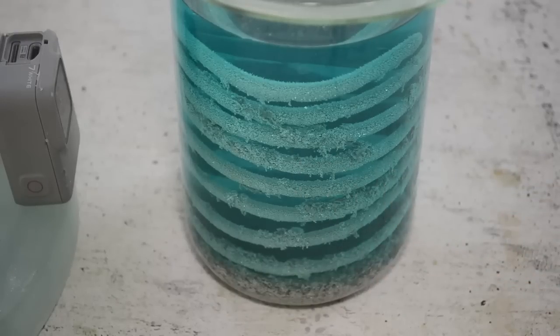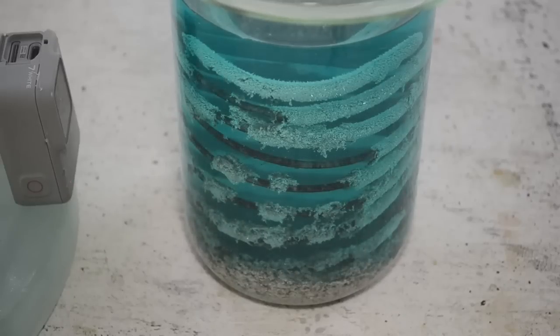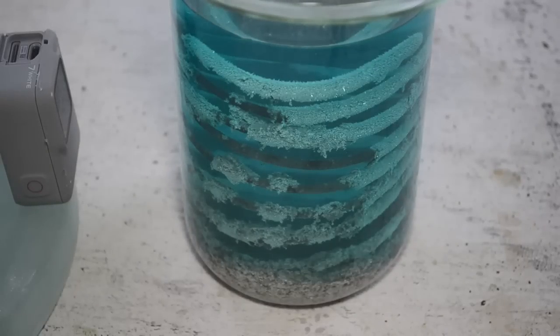Very cool. Very cool. And right now, the wire in there is about 3 times its original diameter with silver on it. Let me wrap on the table again. Yep, there you go. Look at that. I'm getting probably 1/2 inch of silver on the bottom of the beaker already. So, it's really coming along in there.